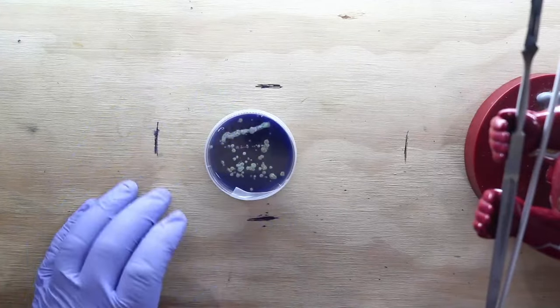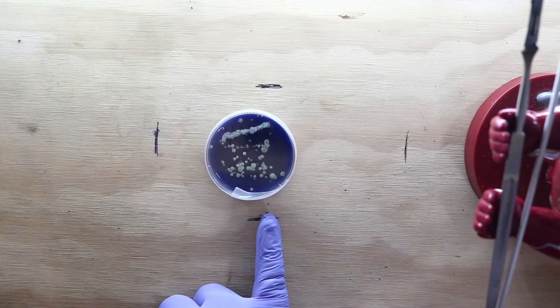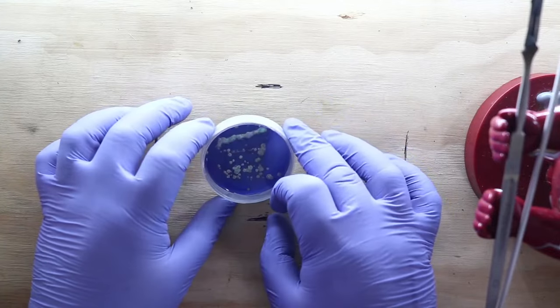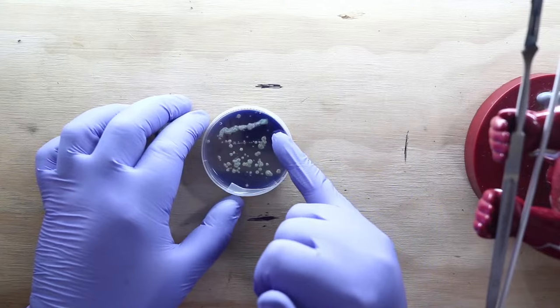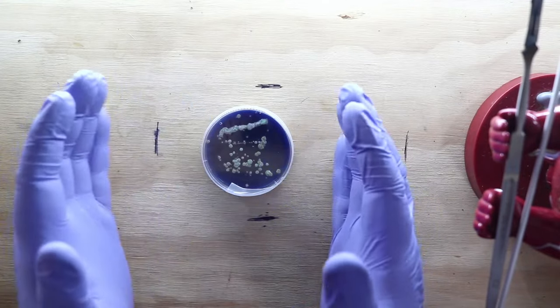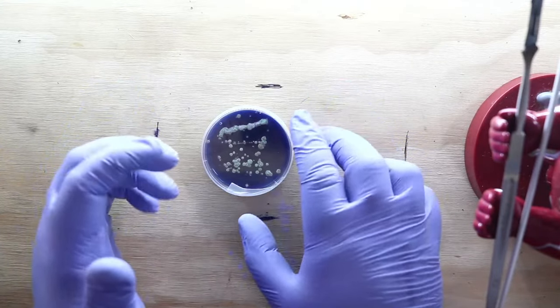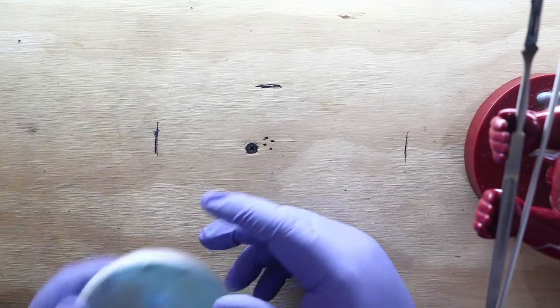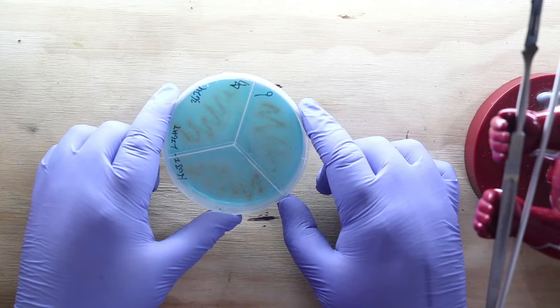I like touching things. All right, so here is an example of a spore streak of the honey mushrooms. And you can see a vague pattern. It kind of breaks down here when it gets a little bit quicker or gets a little bit slower. But these are the honey mushrooms. Most of their mycelium is digging down deep. They don't really seem to like to cross out across the surface as much. But there's that. And then these are spore streaks. Can you see that, Samantha? Yes. Okay.